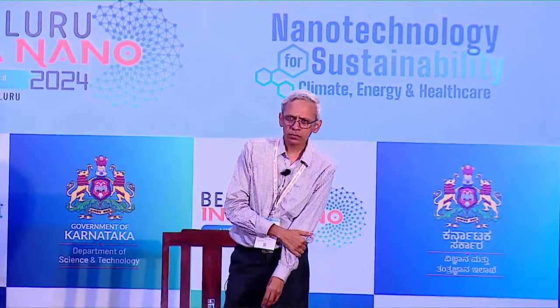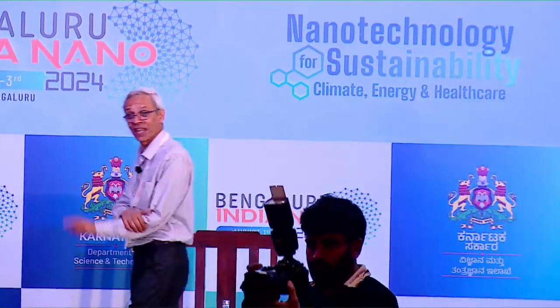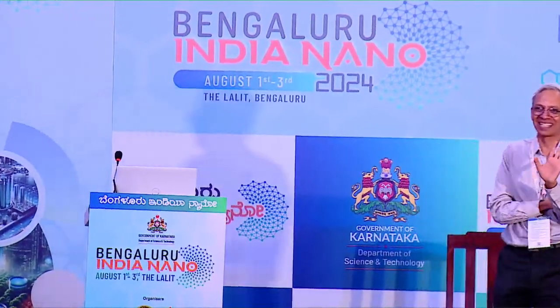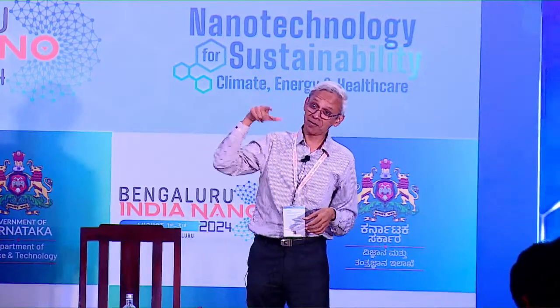Sir, we generally see the microscope in a vertical mode. Is there any instrument in the horizontal? Good question. The first instruments were actually the horizontal mode, right? Of course, gravity doesn't have any role to play in this one. But the first instruments were actually shooting electrons towards the user. But now the conventional design is to only form vertical microscopes. Various design issues are there, but all current microscopes are vertical, but the very first microscopes that were built were horizontal.